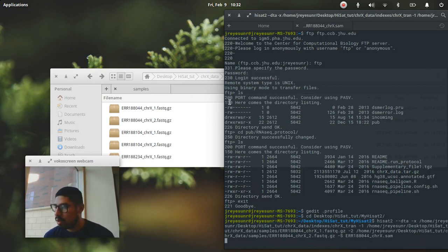Should roughly take about a minute or two. It all depends on what your processor is and how much memory you got.